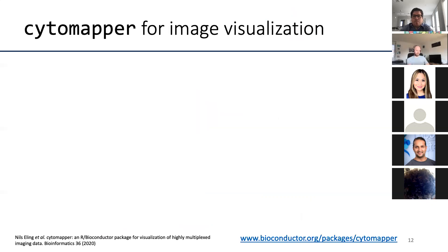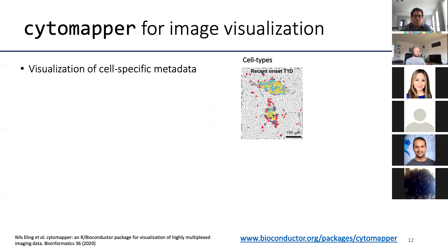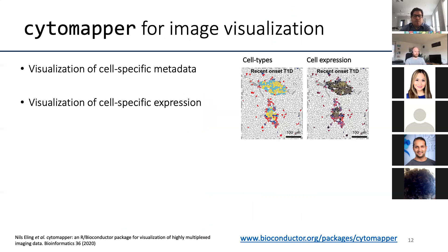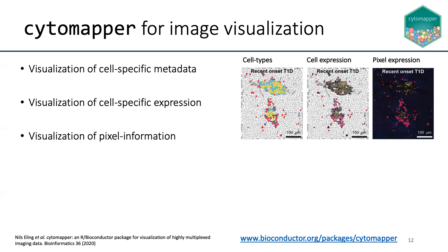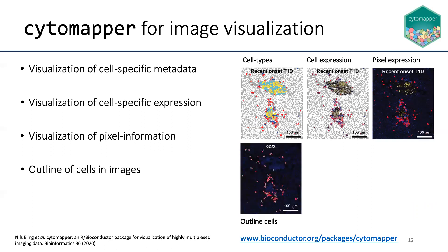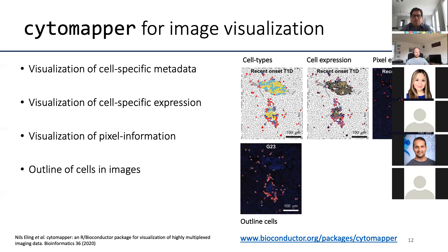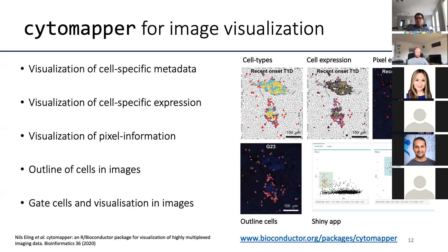I'll first talk about CytoMapper for image visualization directly in R. It allows the user to visualize cell-specific metadata on segmentation masks — you can see individual cells colored by cell type. You can also visualize mean cell intensity or other expression features on segmentation masks, directly visualize pixel information as a pseudo-color composite image, and outline cells on images, which is quite nice for checking segmentation quality control.